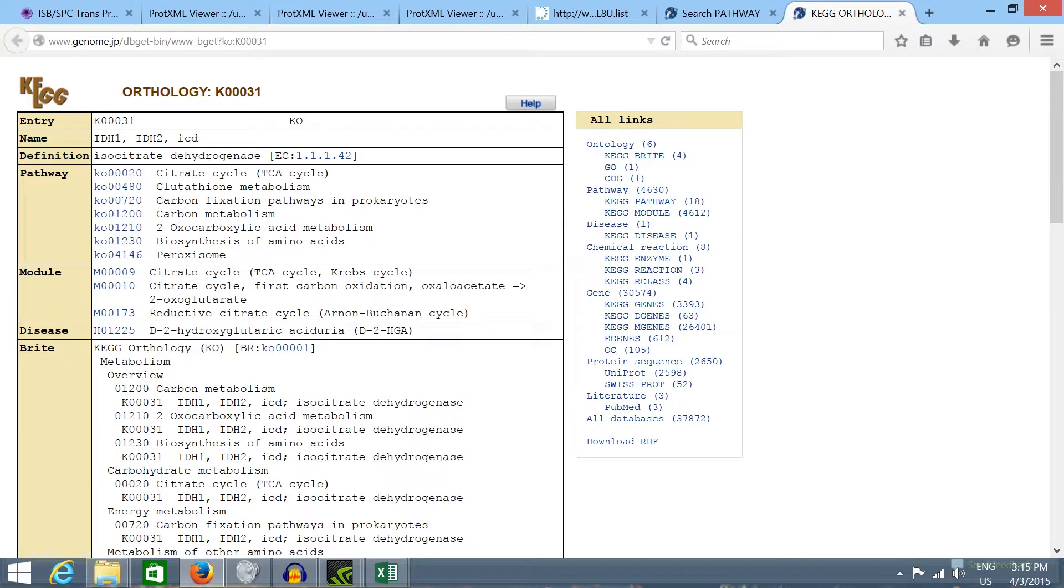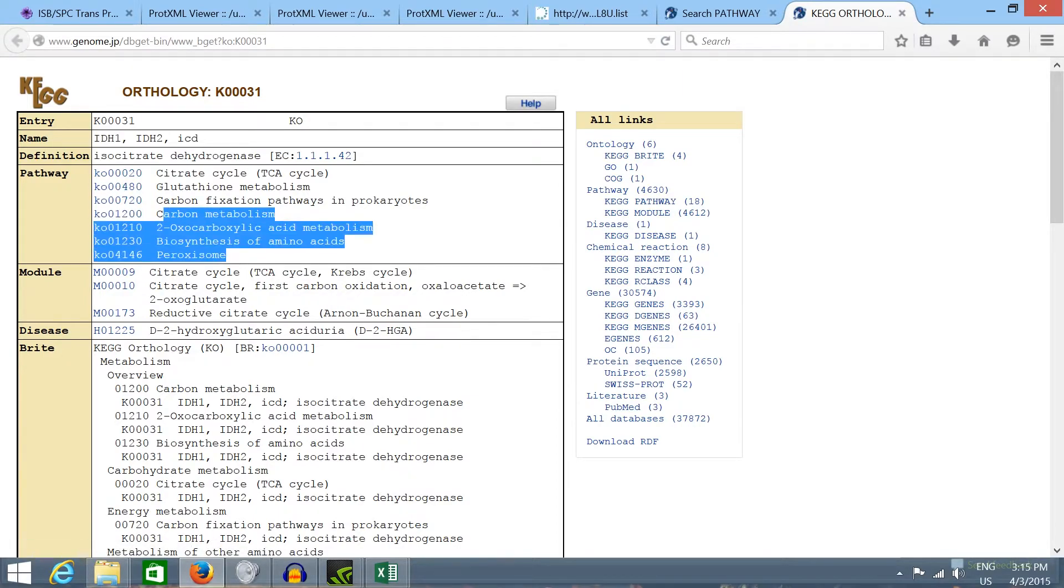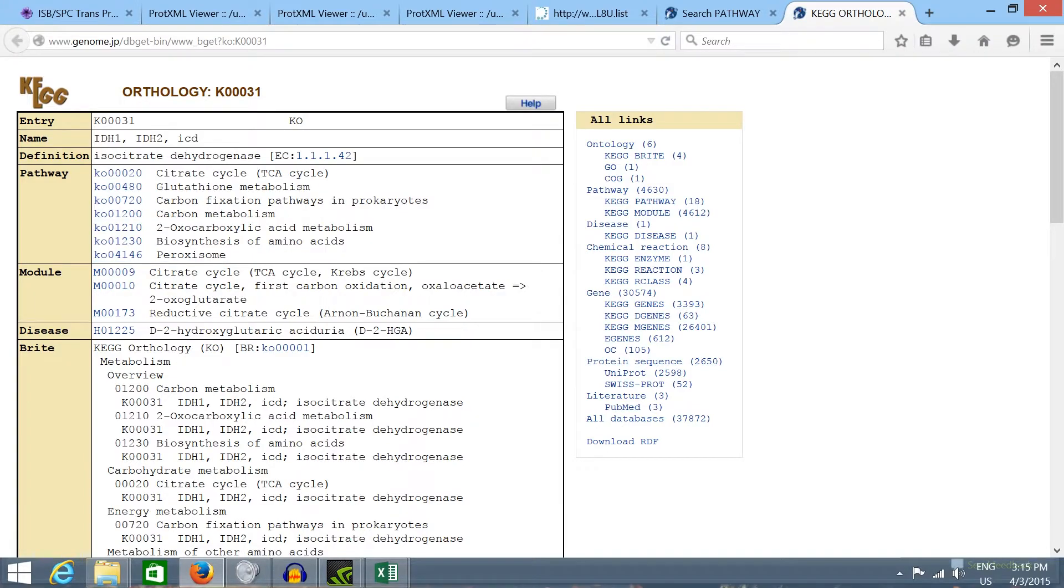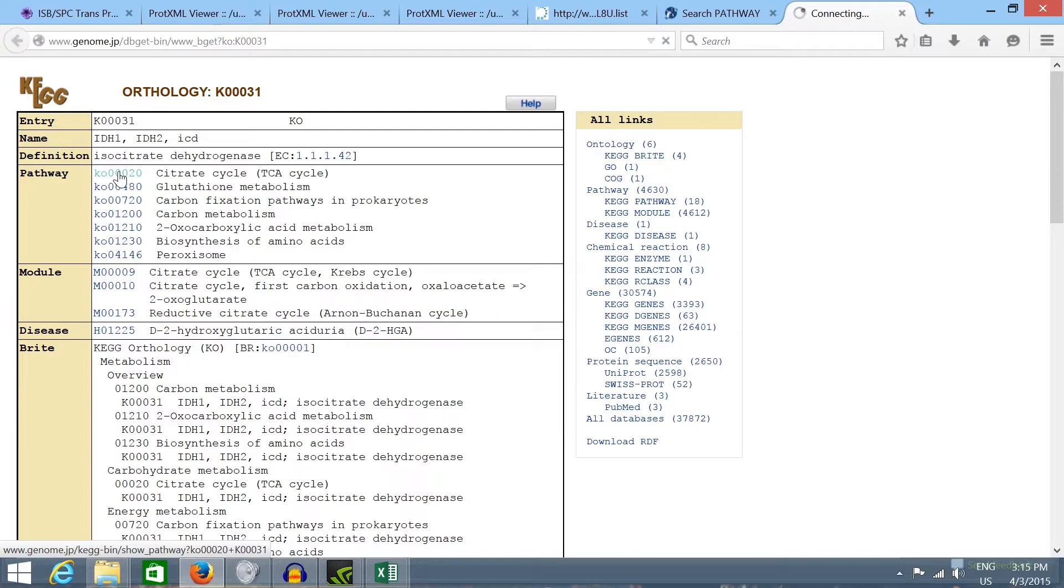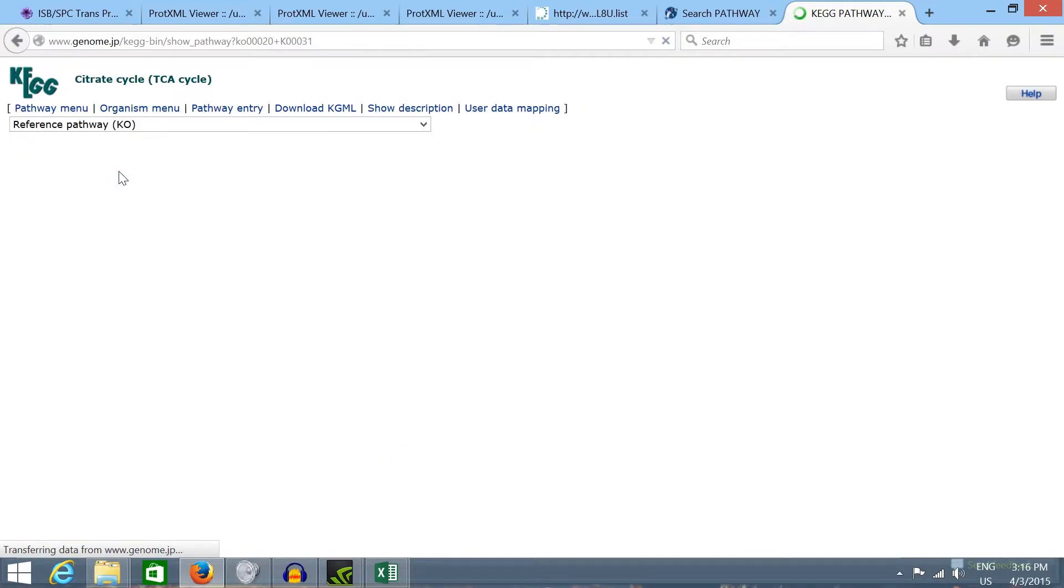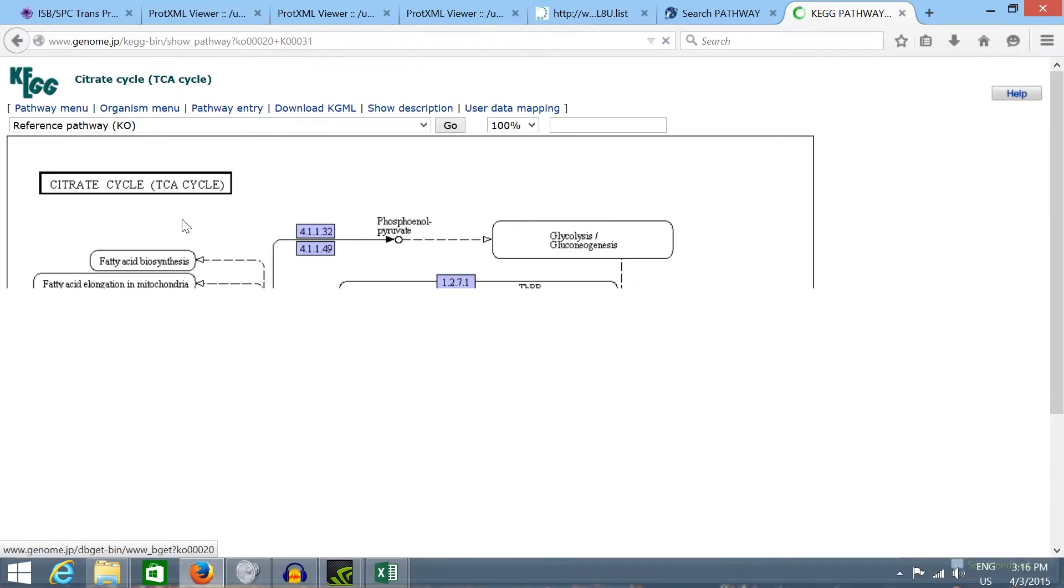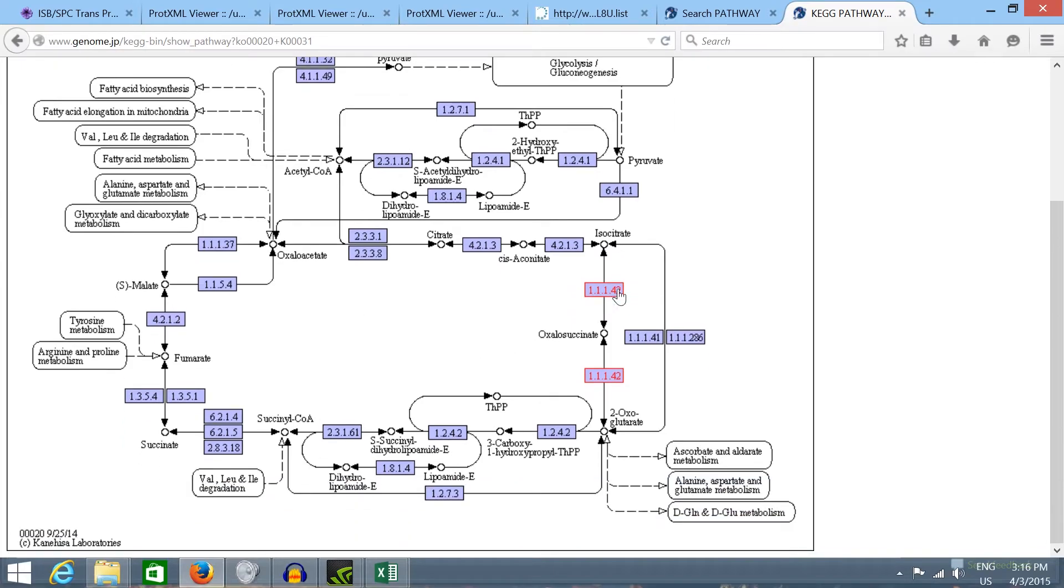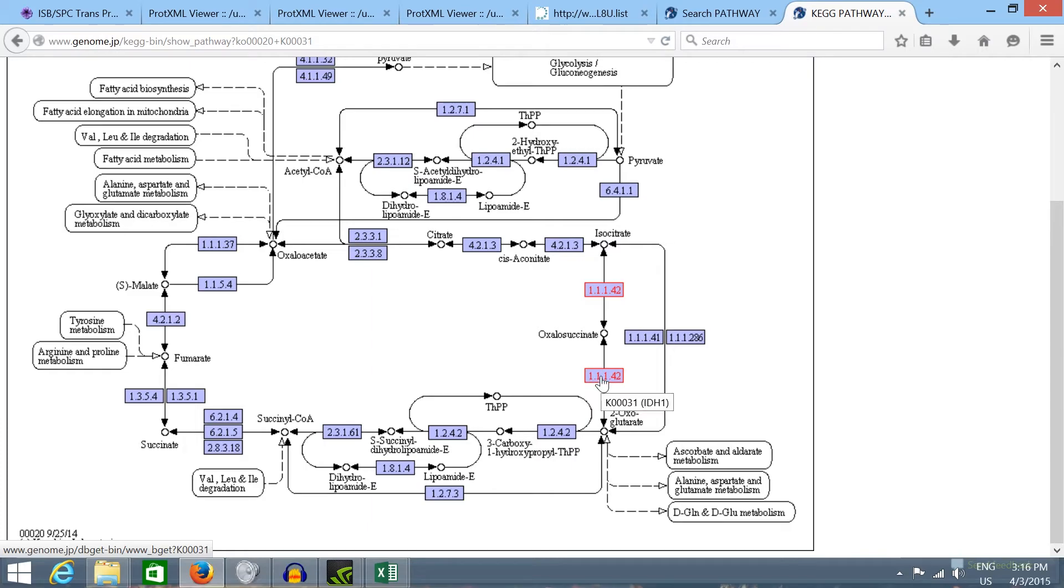This is the list of pathways where this enzyme performs reactions. If we click in one of these pathways, we'll see the metabolic pathway mapped with our enzyme marked in red. So this enzyme and this enzyme here should be our isocitrate dehydrogenase enzyme.